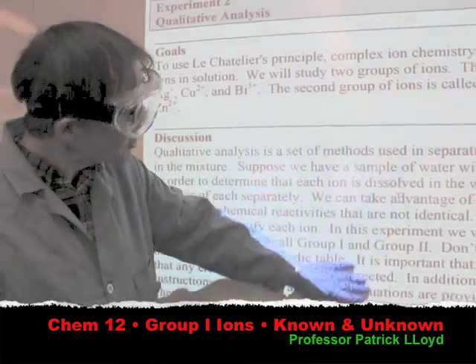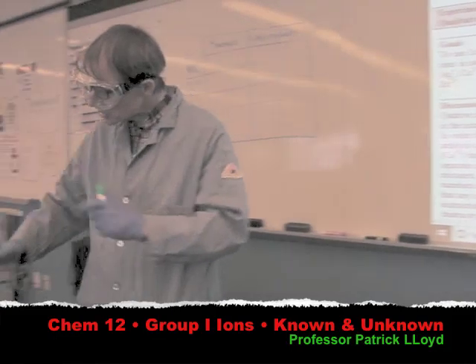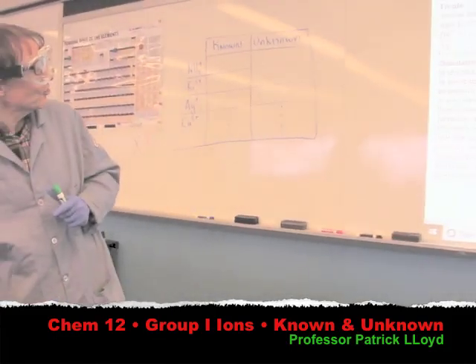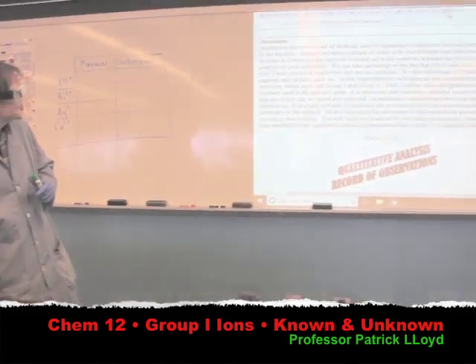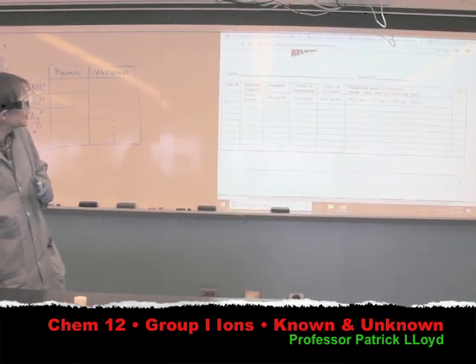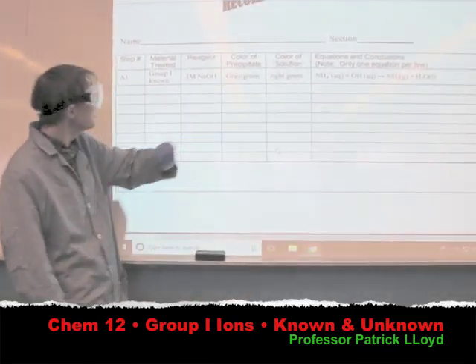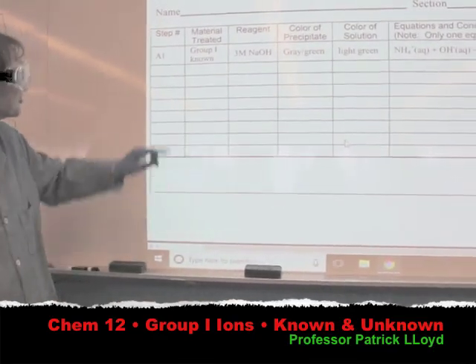So the methodology here, the introduction and the methods are shown on our board here. Let me scroll down a little bit so you can see the discussion. This gives you some background information. This is a way that you could take notes during the experiment. I'll leave it to you to do that for yourself.